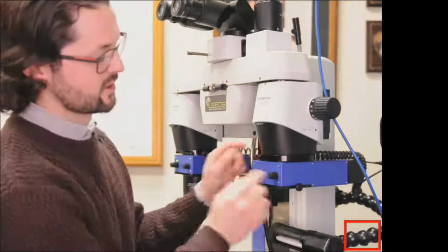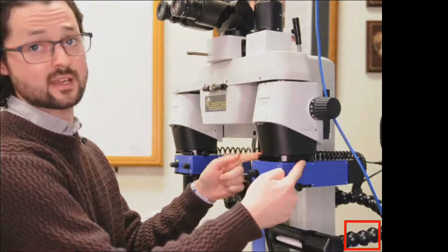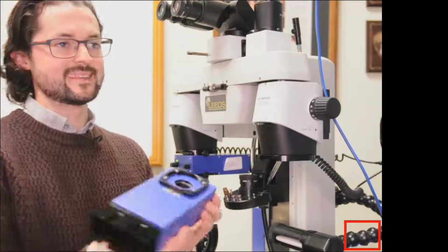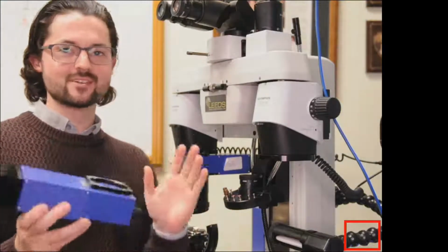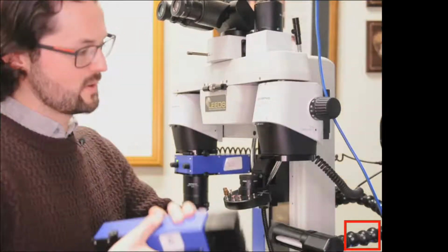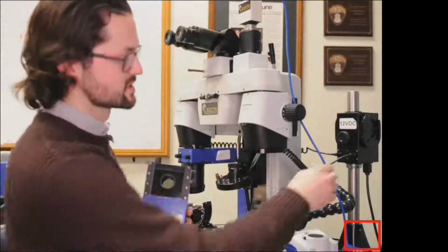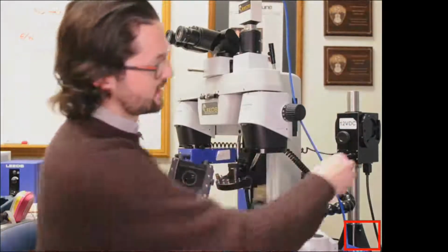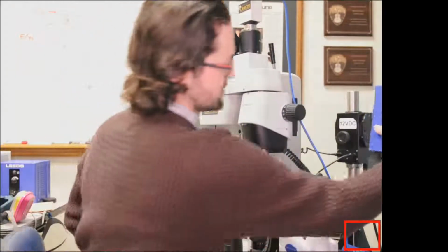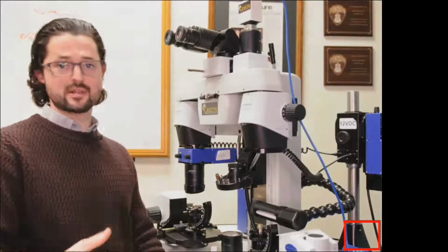And then we're going to loosen this thumb screw right here on the other side. It's ambidextrous. We can actually install it on either side. This whole thing slides out, and that's it. There's no wires, there's no cable management, it just slides out. And now I'm going to zoom out a little bit, and you'll see there's this component back here. This sticker will come off once we finally QC it. This whole thing will actually just slide right in like that for storage for when you're not using it.